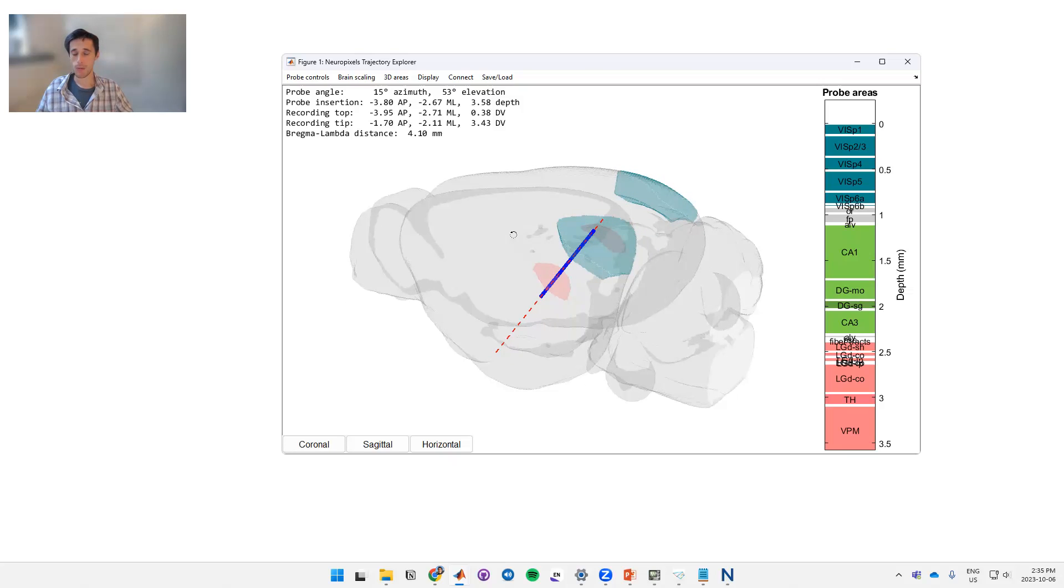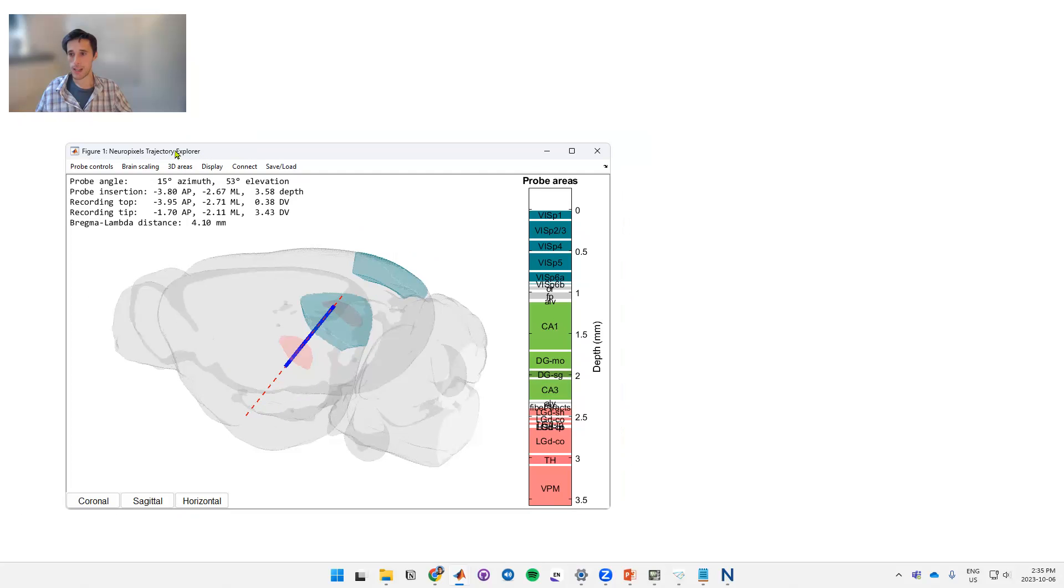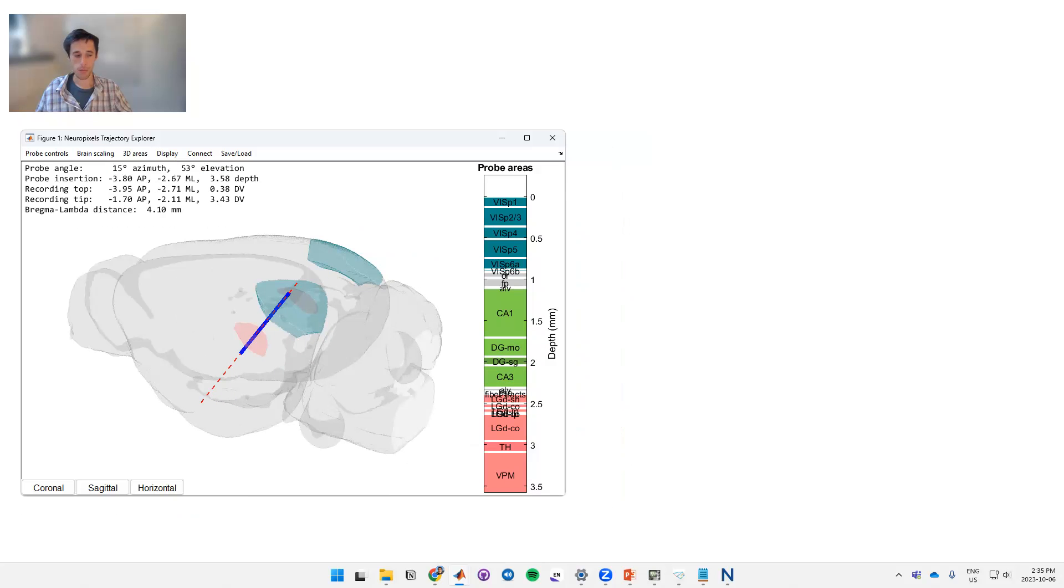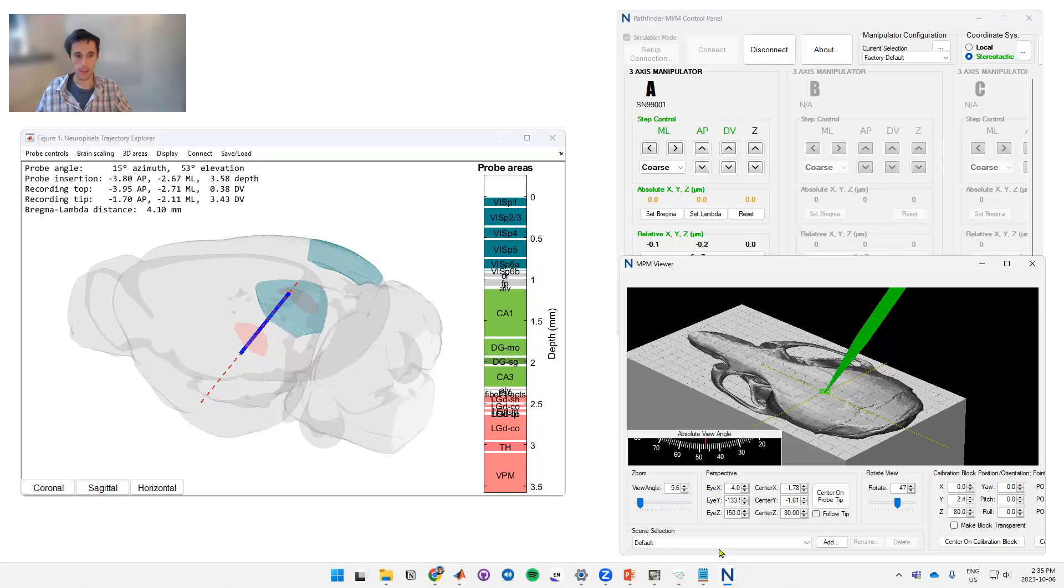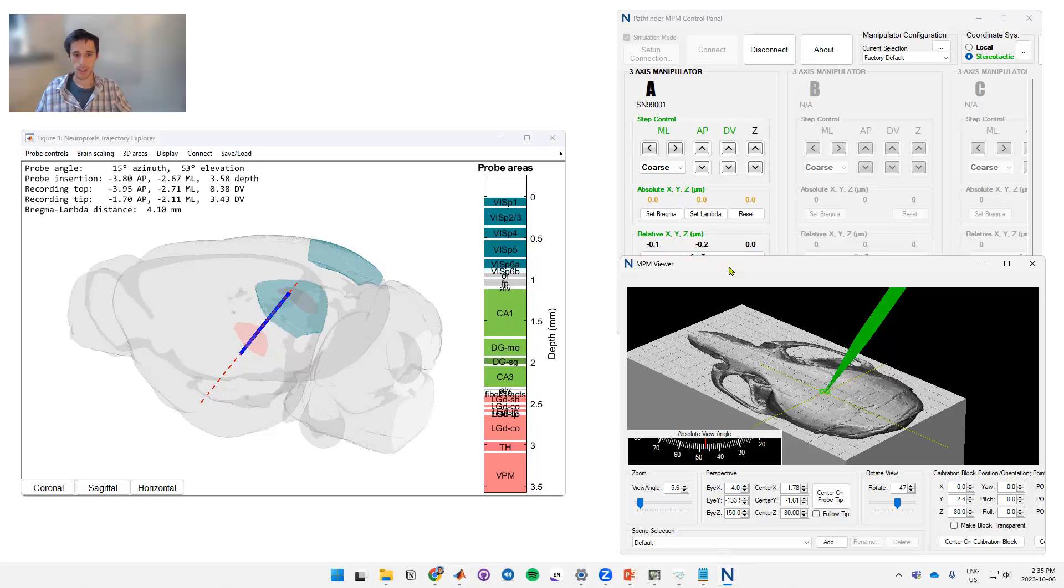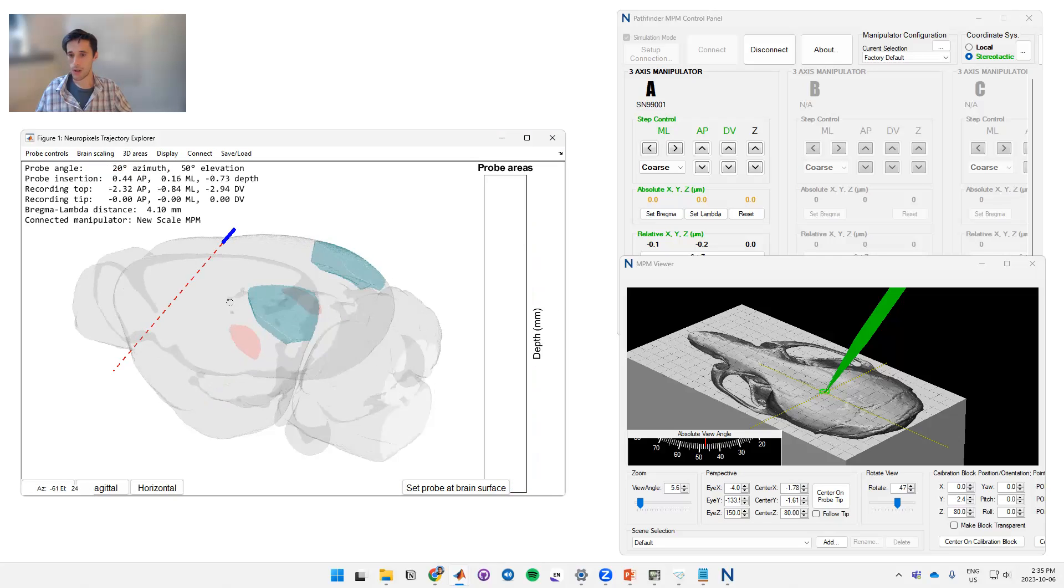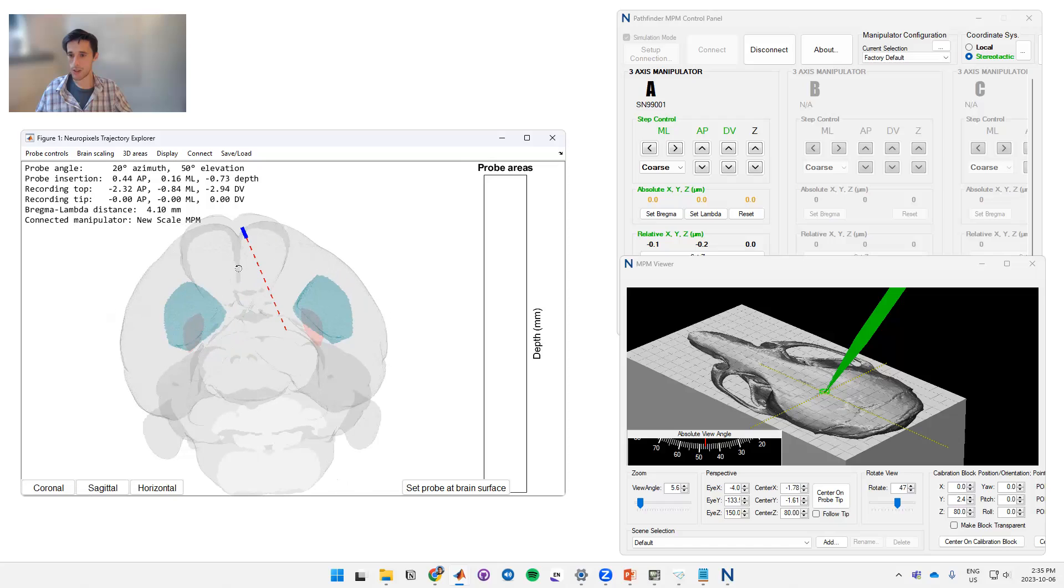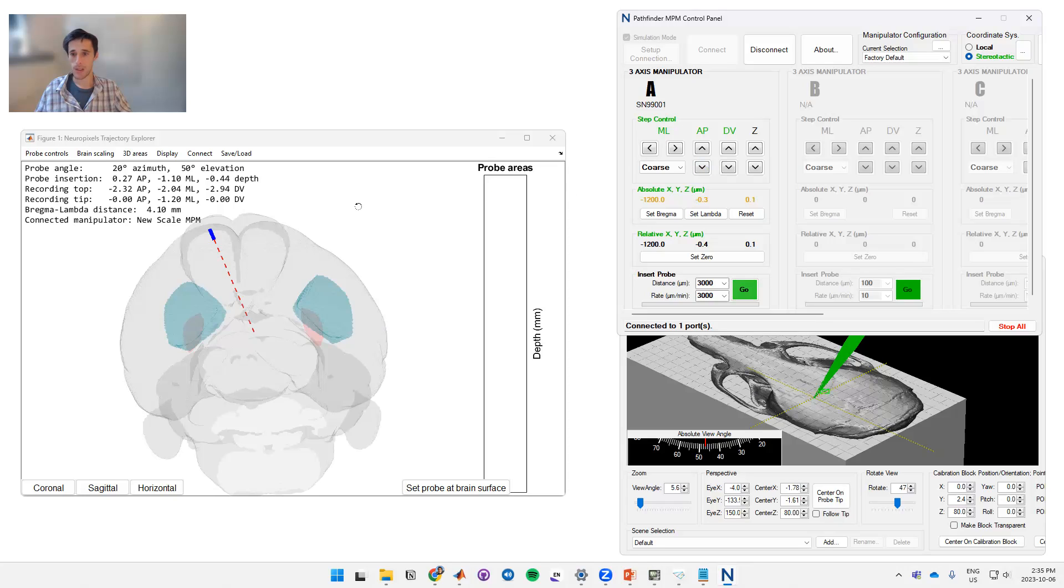Let's say that this is the trajectory you want to go for. In real time if you use the New Scale NPM manipulators, you can see where you are. So in this case I'll put this off to the side here and I'll pull up the New Scale software. If you have the software you can connect to it by hitting connect, going to manipulator, and then hitting New Scale NPM. Okay, so now the NeuroPixels Trajectory Explorer is talking to your manipulator.